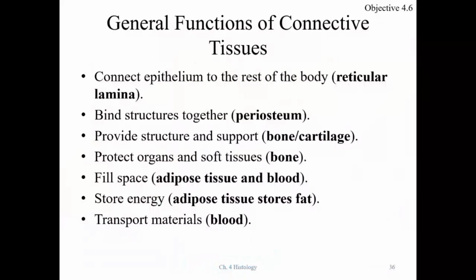And welcome to part 2 of Tissues Lab. This will be a 3-part video. I wanted to break it down into 3 parts so you guys will have a little bit easier time digesting it. So we're going to start with the connective tissues today, and we'll focus on it because there's a lot of them. And then we'll look at muscle and nerve together by themselves and the membranes.